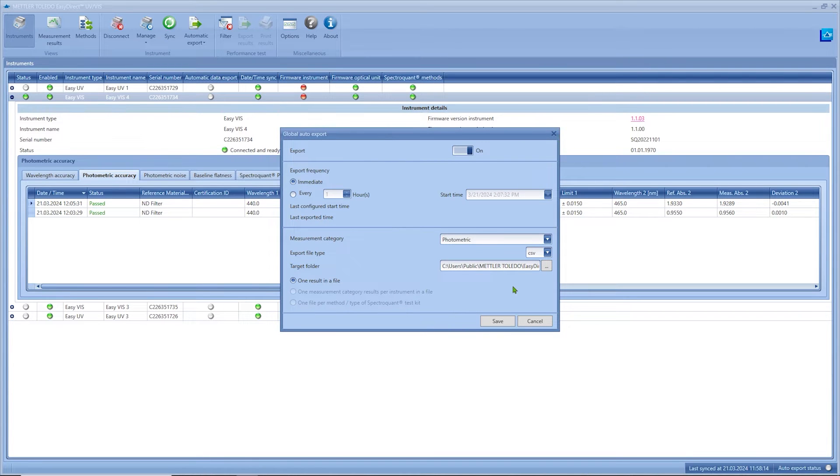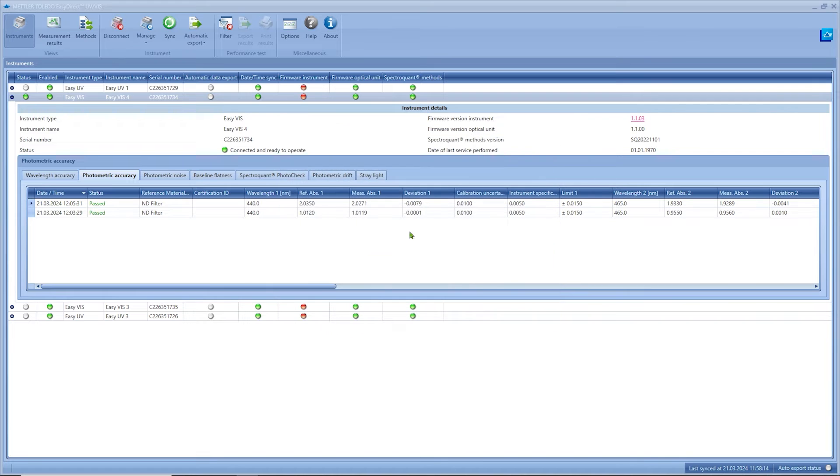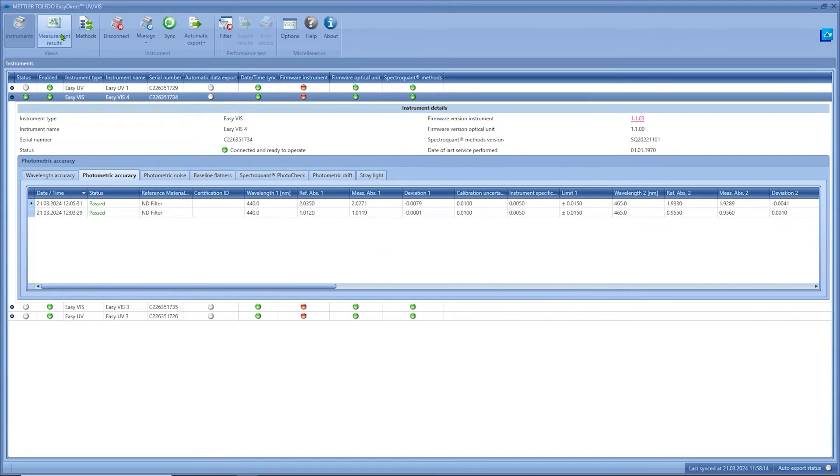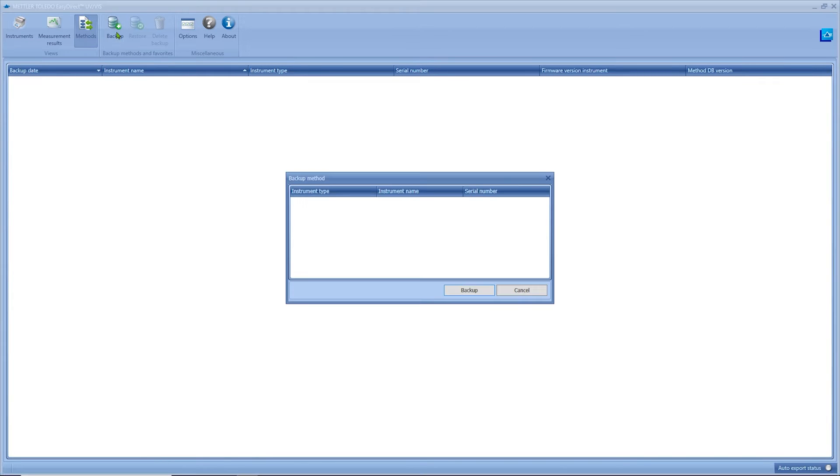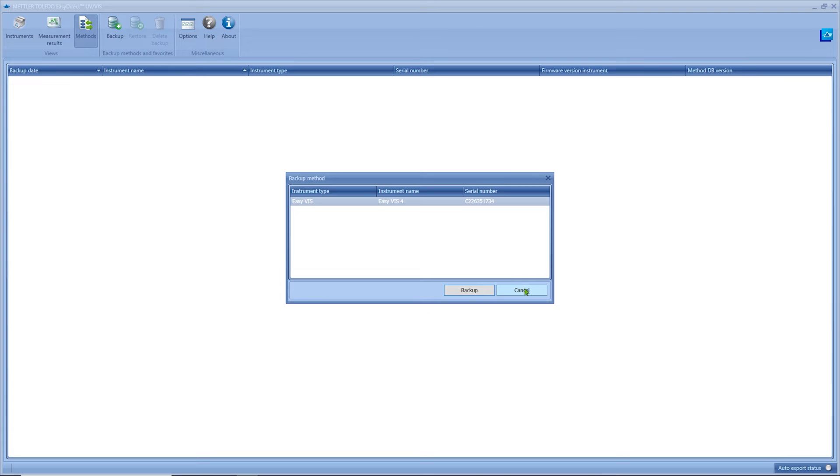Below measurement results you can find all results which are transmitted to the database. We will have a closer look to this view later. Below methods you can store and restore backups of your connected instruments. With this feature you only have to define the methods once on an instrument. Afterwards you can restore the corresponding backup also on other EZ Plus UV-VIS spectrophotometers.